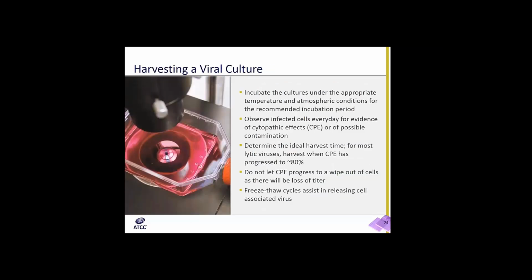Some things to remember while harvesting a virus culture. First of all, the virus culture is incubated at the appropriate temperature and atmospheric conditions, and during the recommended incubation period, you have to observe the infected cells every day. You want to look for cytopathic effect as well as any possible contamination that can be observed macroscopically or even under the microscope.